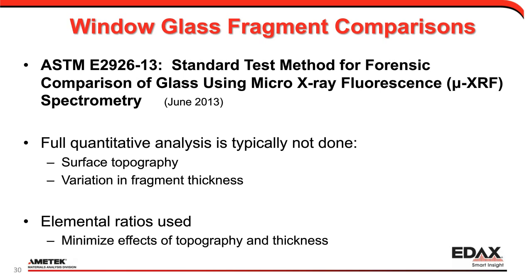It's ASTM method E2926-13, standard test method for forensic comparison of glass using micro X-ray fluorescence spectrometry. I think the first published issue went out in June 2013.